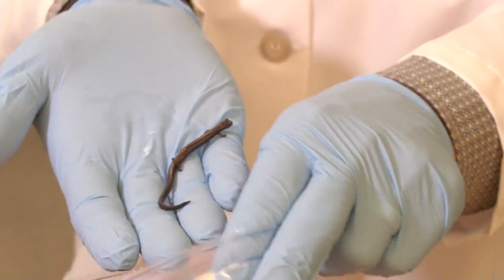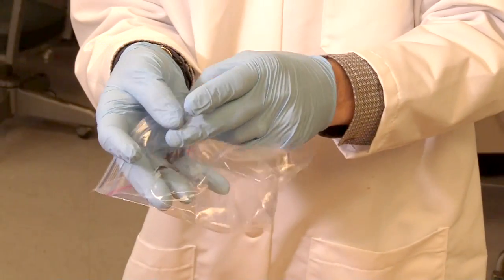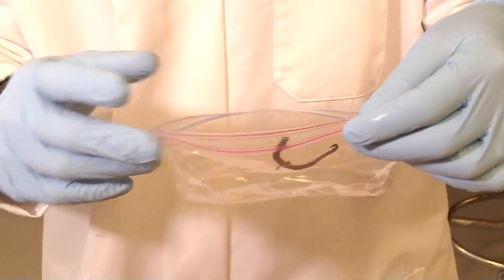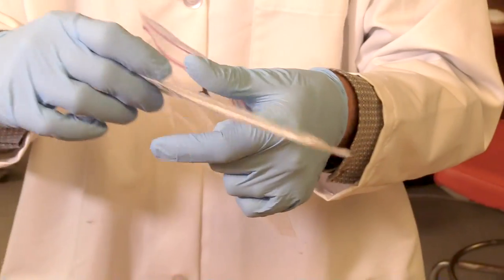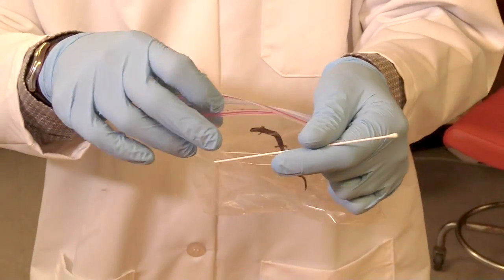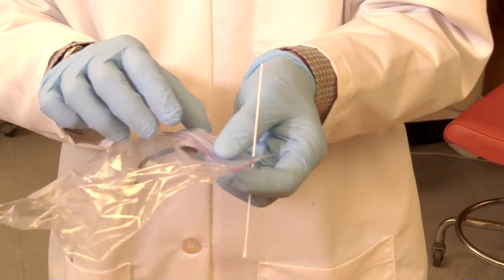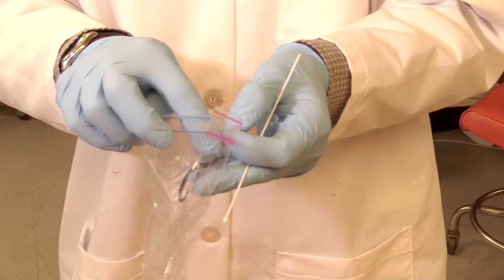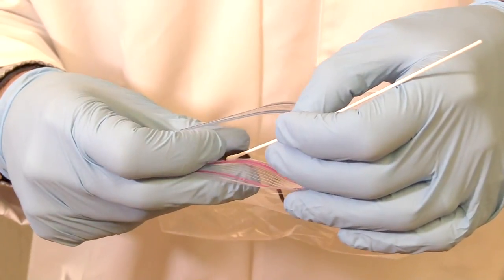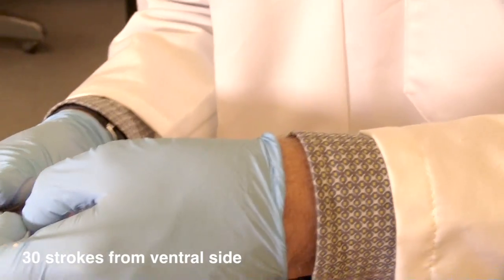Because they get really squirrely, I put them in a little Ziploc bag that helps me handle the animal. What we want to do is take 30 strokes from this little swab right here — here's our chytrid swab that we use. There's our guy in the bag. I'm going to slide the swab in under him and sample the ventral side of the salamander and try to get 30 swabs from this guy.